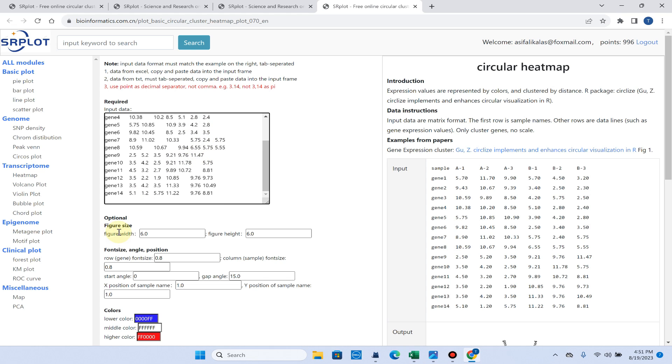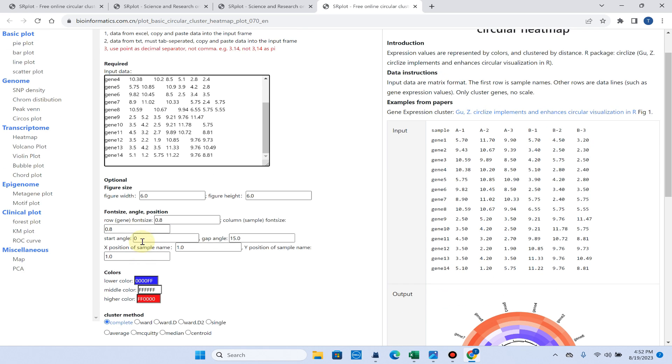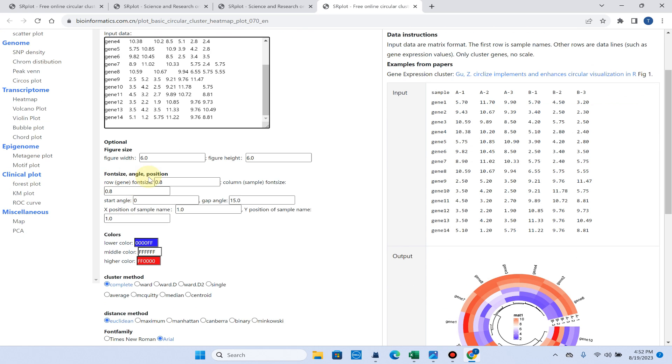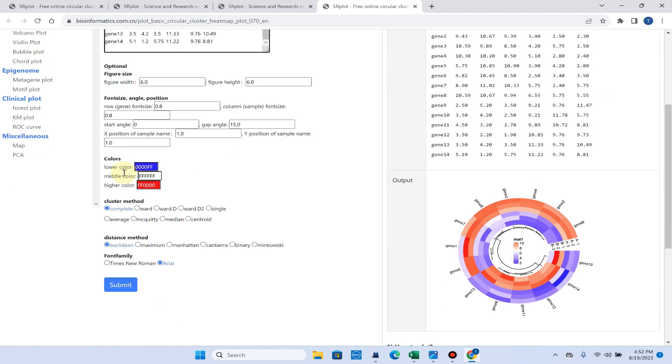After that you can select your figure size, figure height, font size, angle and position, and you can select the colors of this matrix key.